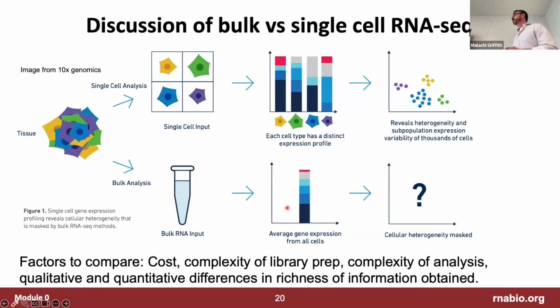Have you applied the single nuclear approach to multinucleated cells, and has there been success with that, like a placental cell or osteoblasts? We haven't. So the question was, have you applied the single nuclear approach to cells that are multinucleated? Not on purpose, although we have done some experiments with Reed-Sternberg cells from Hodgkin's lymphoma that are multinucleated.